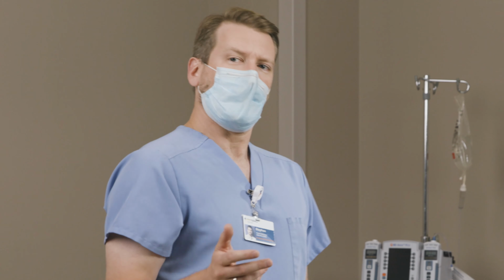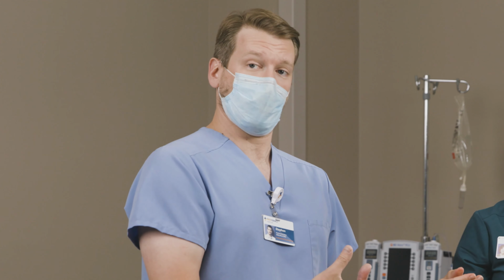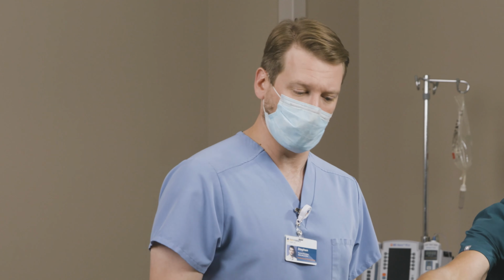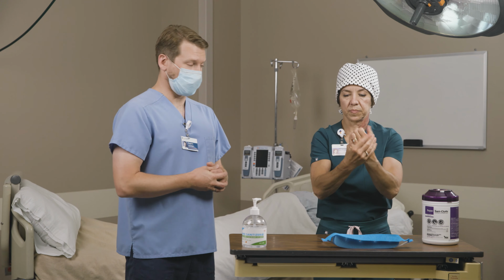And dispose of that, whatever is appropriate at your facility. We may be recycling those in the bins or they may be disposed of. So please refer to wherever you work. And she'll perform hand hygiene again.